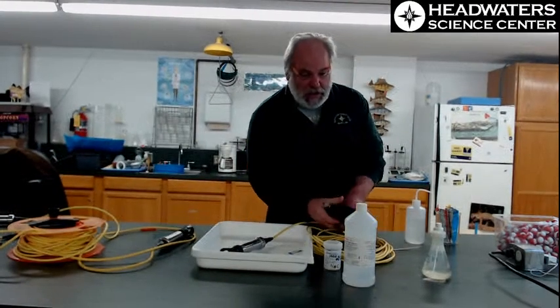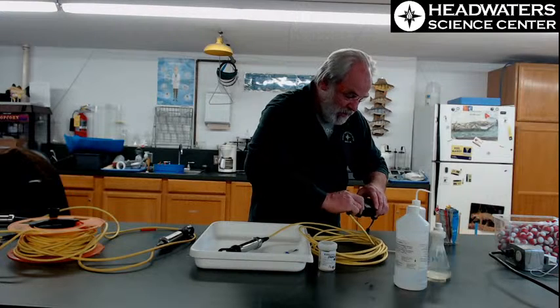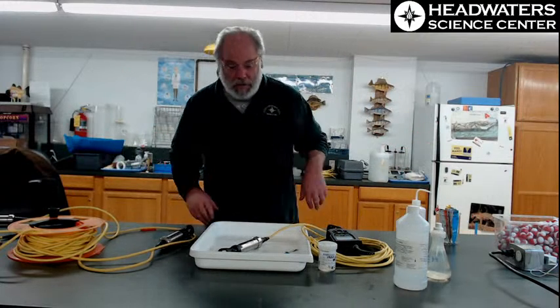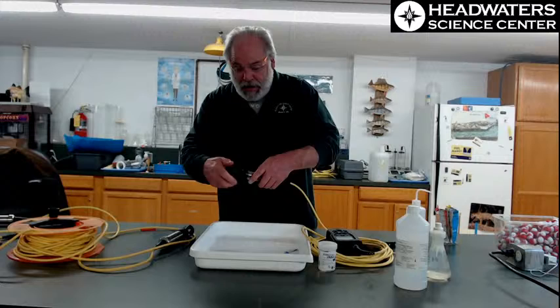Now if you're doing this with our equipment, I want you to do it right. So I'm going to try and tell you how to do it right, and how to do it right is the way I do it. And the way I do it is the way it's done by the Pollution Control Agency, the way they take data in the state. And so I feel like that's the kind of thing you want to do.